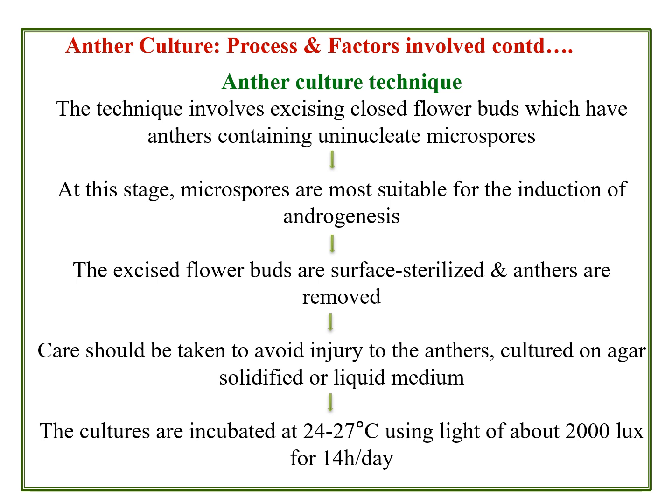Anthers are removed. Care should be taken to avoid injury to the anther walls. Anthers are cultured on agar solidified or liquid media. Either the solid agarized media or a suspension culture can support the anther culture. The cultures are incubated at 24 to 27 degrees centigrade using light of about 2000 lux for 14 hours per day.